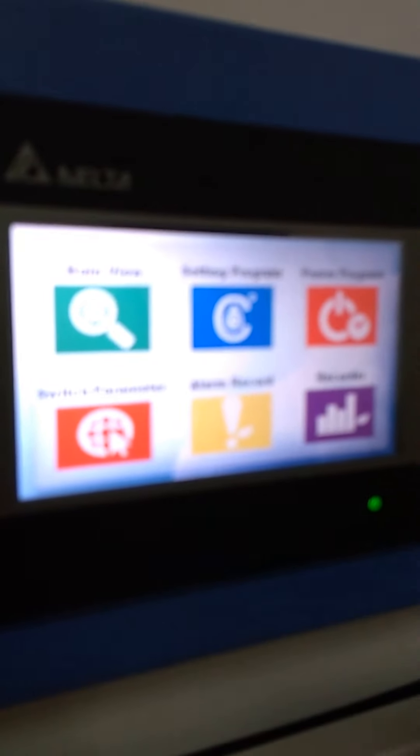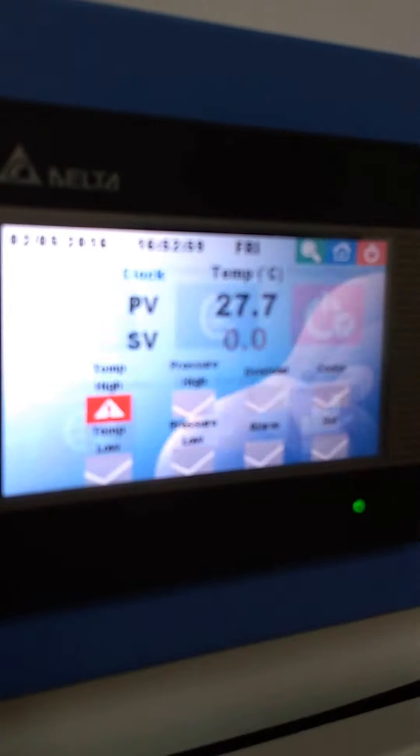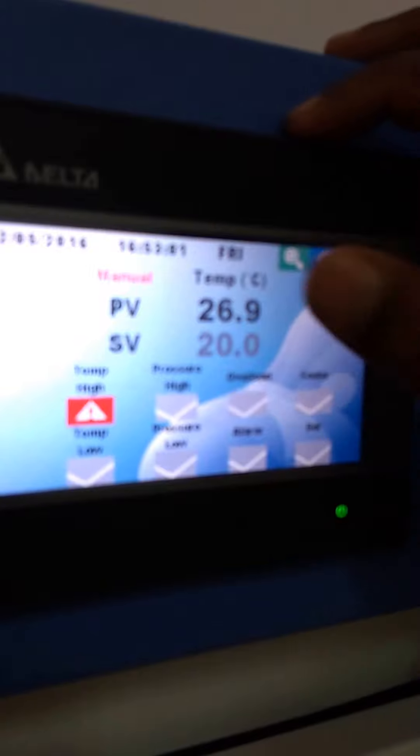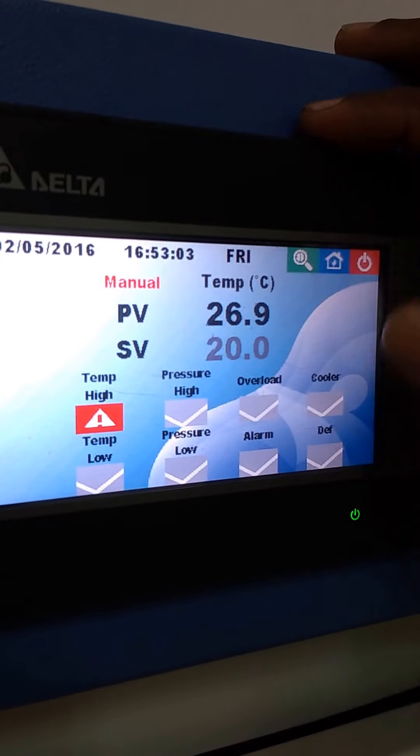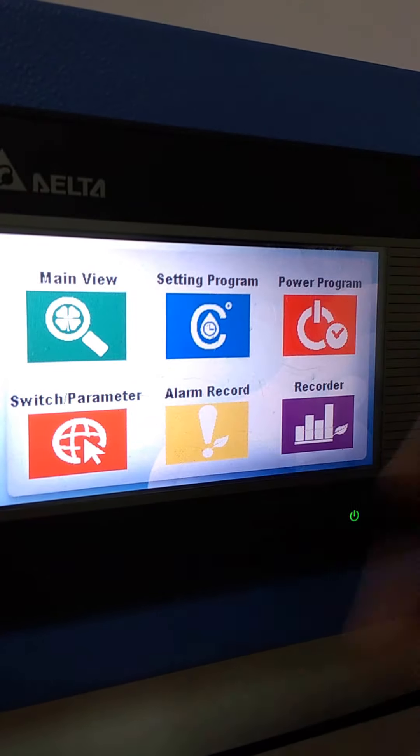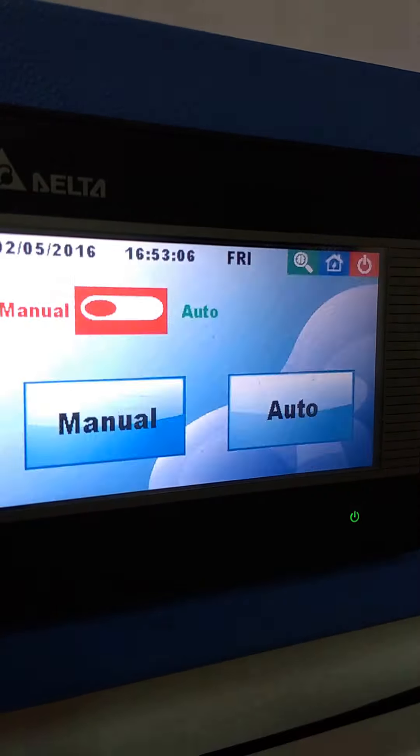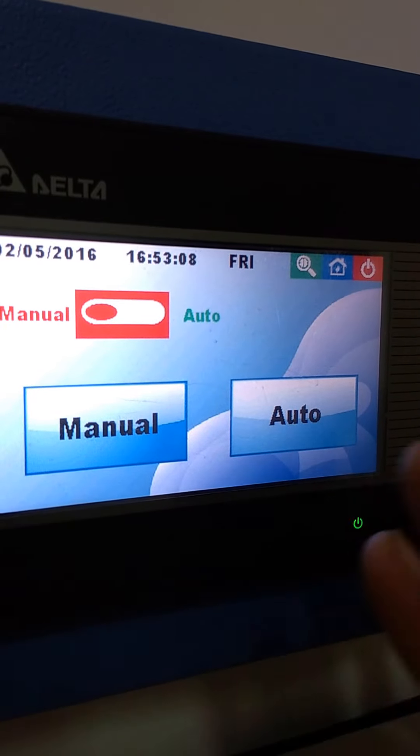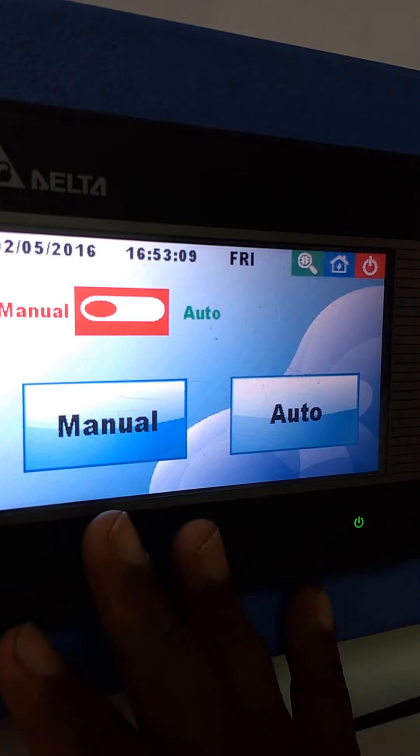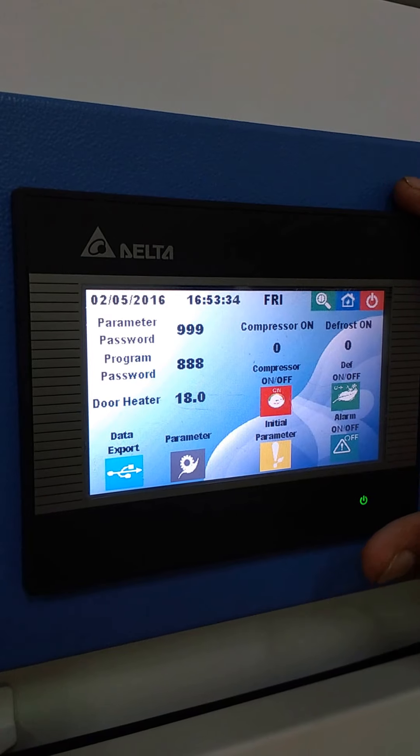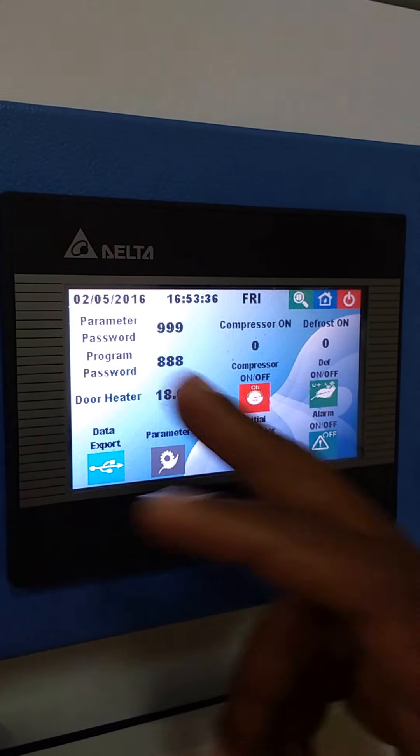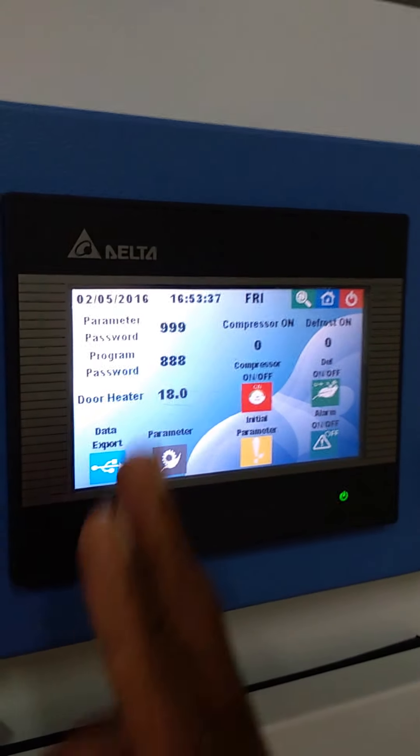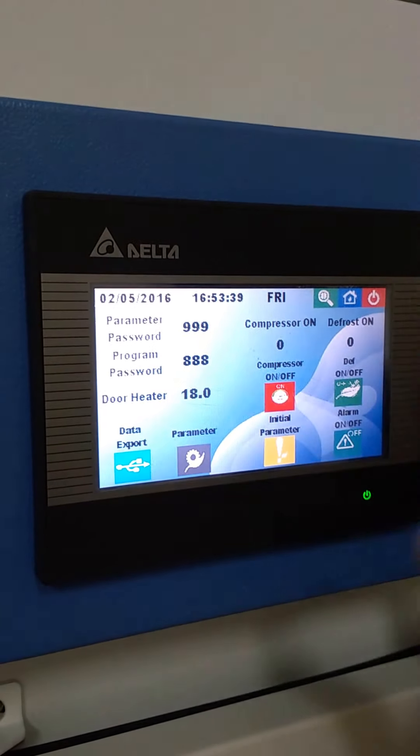Coming to the panel, it has six apps. In main view, you can see the present value and set value. In setting programs, you can choose auto mode or manual mode. It is a password-protected control panel which has parameter password and program password that can be monitored.